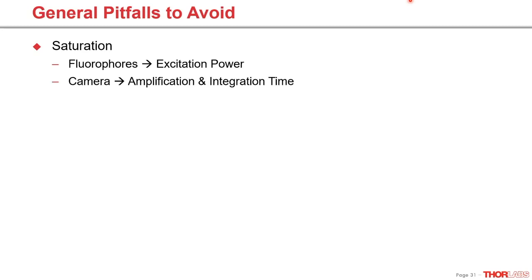Another part that can be saturated is your camera or detector. Look at the histogram of your camera to make sure there are no pixels beyond the highest collection capability of the camera chip. Make sure your camera gain is at an appropriate level to avoid saturated pixels. The integration time can also be shortened if you're already saturating.